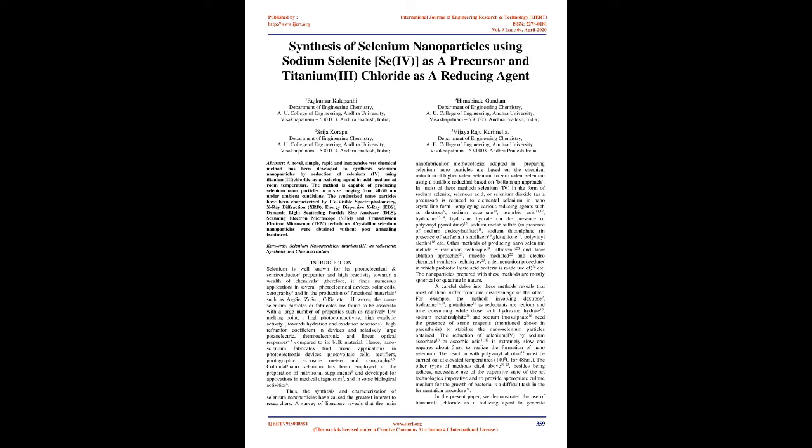The synthesized nanoparticles have been characterized by UV-Visible spectrophotometry, X-ray diffraction (XRD), energy dispersive X-ray (EDS), dynamic light scattering particle size analyzer (DLS), scanning electron microscope (SEM), and transmission electron microscope (TEM) techniques. Crystalline selenium nanoparticles were obtained without post-annealing treatment. Keywords: selenium nanoparticles, titanium(III) as reductant, synthesis and characterization.